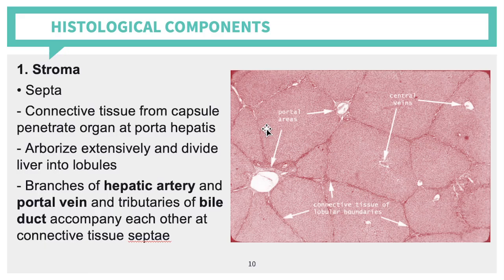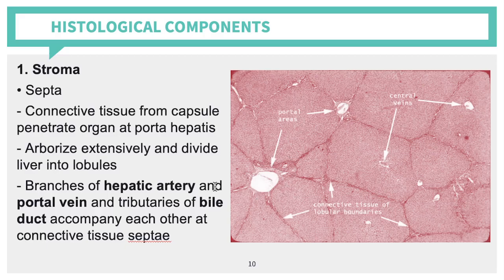Your septa divides the liver into lobules — you can see different lobules separated by this connective tissue boundary. Branches of your hepatic artery, portal vein, and tributaries of bile duct accompany each other at the connective tissue septa. Within the septa, you can also identify the different portal triads, which consist of your portal vein, hepatic artery, and bile duct.